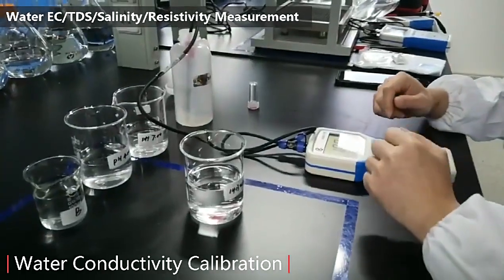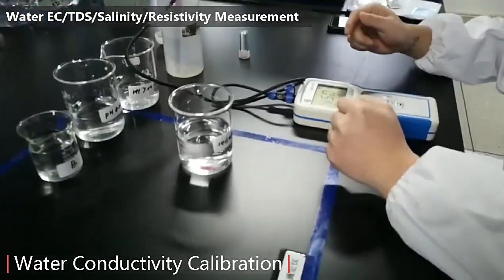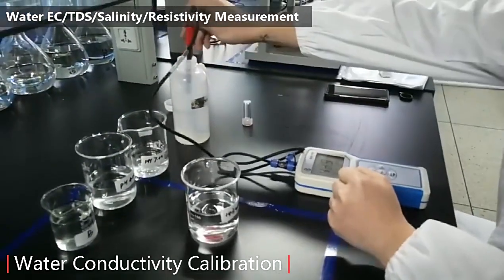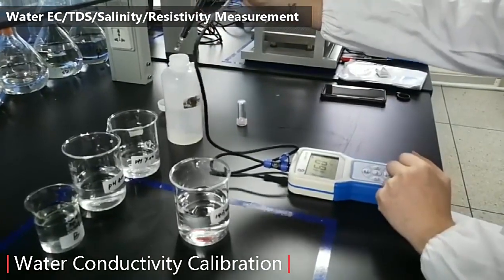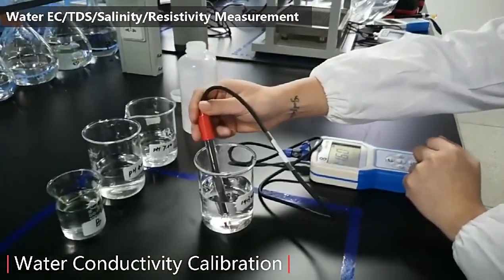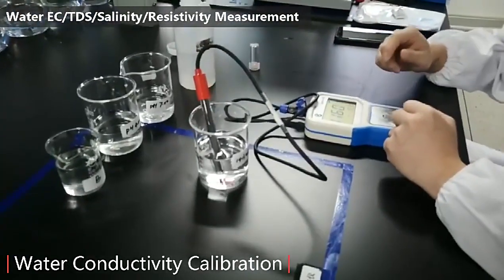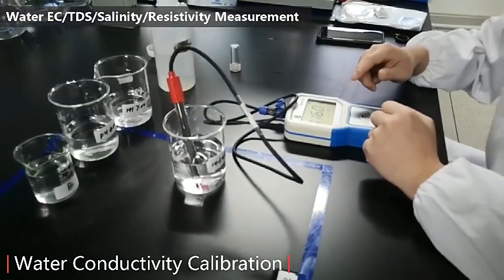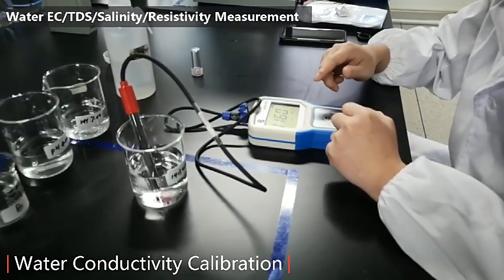Turn on the device. Today, let me show you how to do calibration of the portable conductivity meter. First, we take out the probe and press the calibration button. Put the sensor into buffer 1413 microsiemens and wait for the value to stabilize, around 3 to 5 seconds.